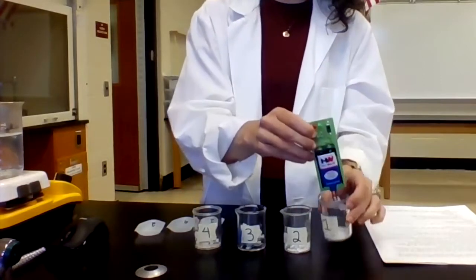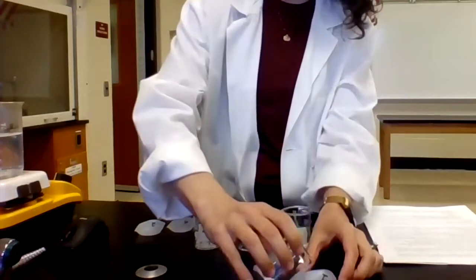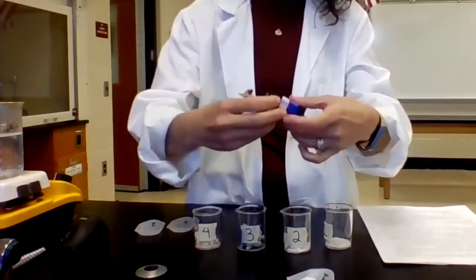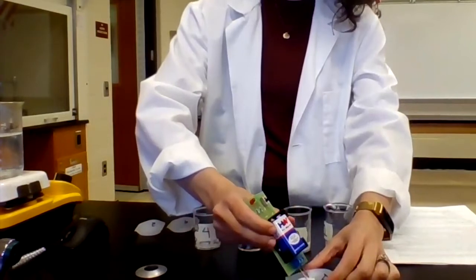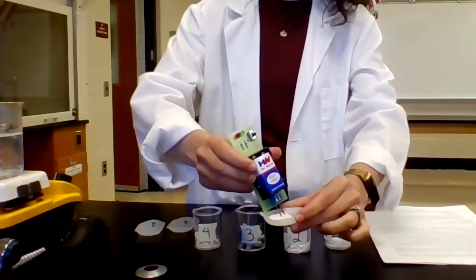Now this doesn't fit very well in the beaker here. So I'm going to pour some of the solid onto a small weigh boat, like so. And I'm going to make sure that it's on. We can see that I have it immersed in the solid here, and it is not lighting up.